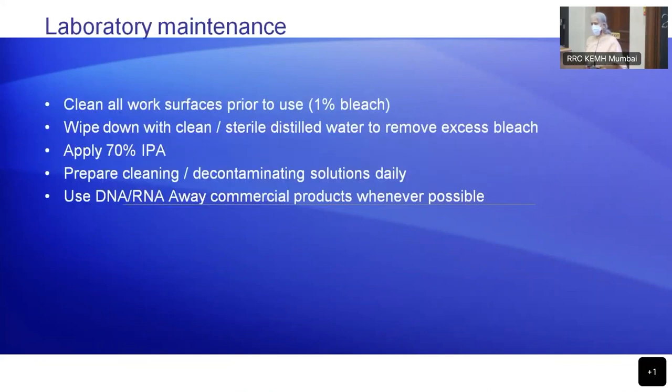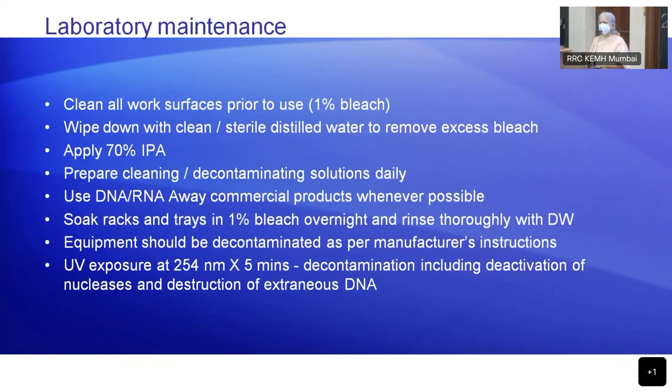That is something that also needs attention. There is nothing more important. Like I said, you need to have somebody employed who just looks at the cleaning and decontamination. I told you how you should be using bleaching powder or bleach. You should use water after 10 minutes. After that, you can use alcohol.